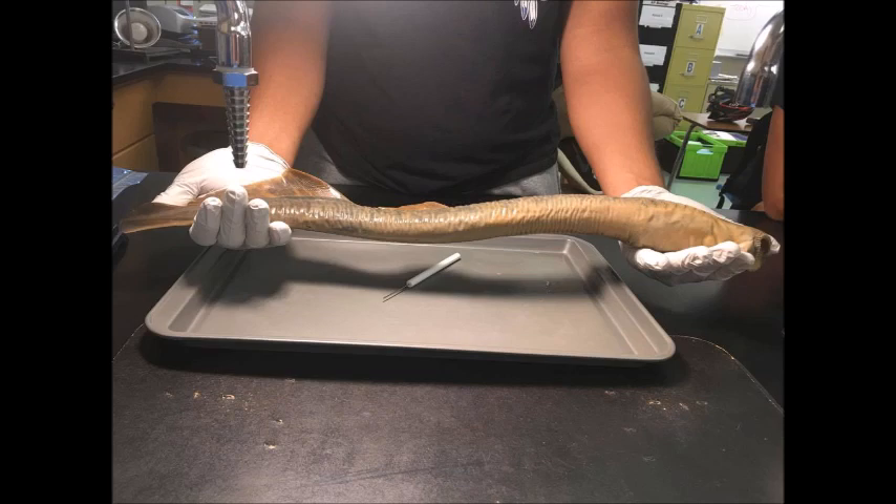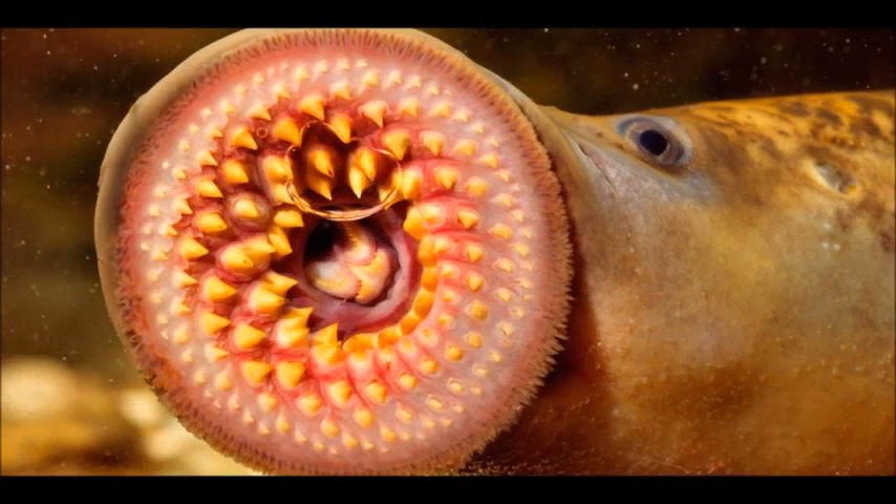The one we will be handling is about 2 feet long. They have well-developed eyes, one or two dorsal fins, a tail fin, a single nostril on top of the head, and seven gill openings on each side of the body. They lack bones, jaws, and paired fins.